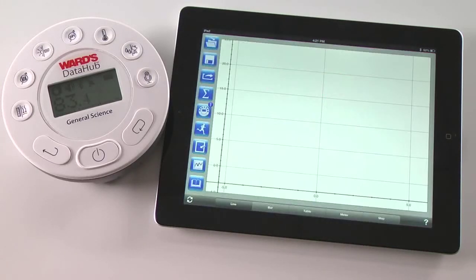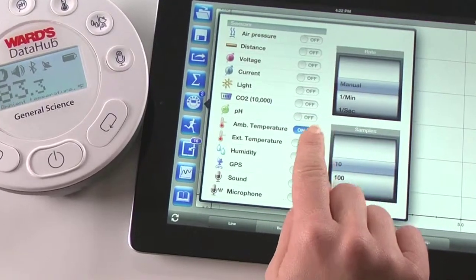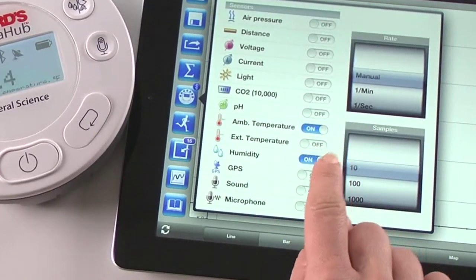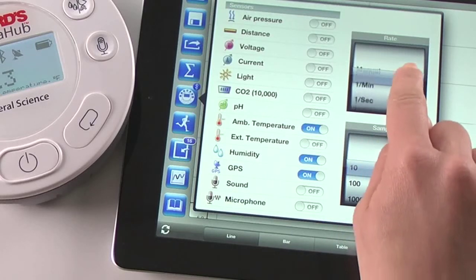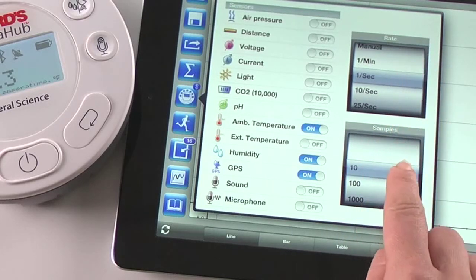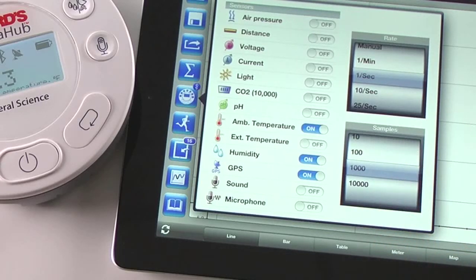In just three simple steps, we're ready to begin collecting data. First, open the setup screen on the Ward's Data Hub analysis software app on your iPad. Next, select the temperature, humidity, and GPS sensors. Then set it to measure at one sample per second for 1,000 samples. Now we're ready to start the experiment and begin recording data wirelessly.